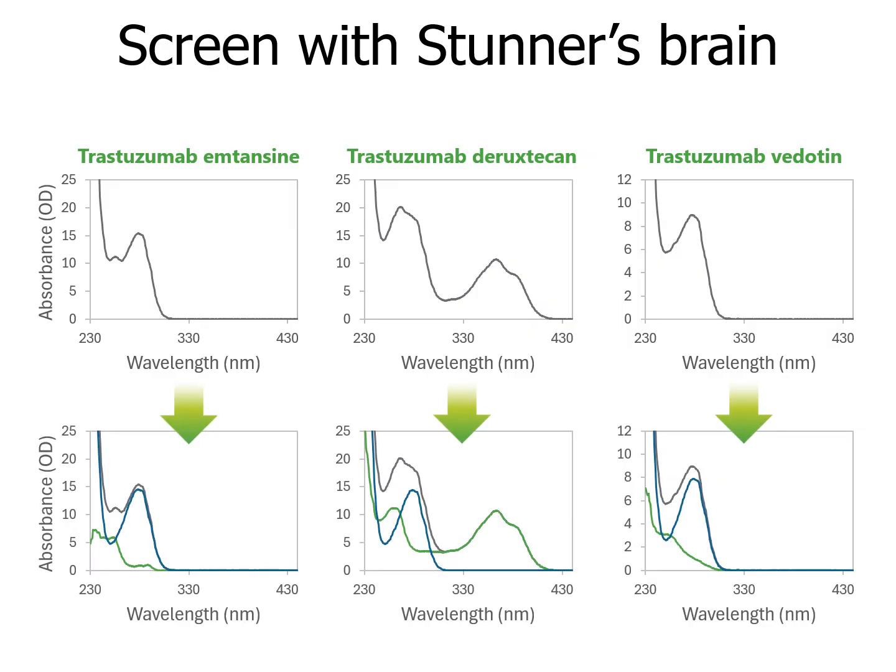If we're screening our ADCs using our ADC Decode application, it's able to understand the correct antibody concentration, figure out where that fit is in blue, and what the resulting drug spectra is in green. You can see that here.